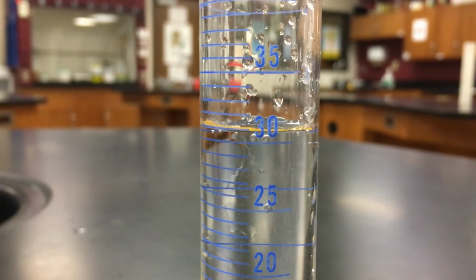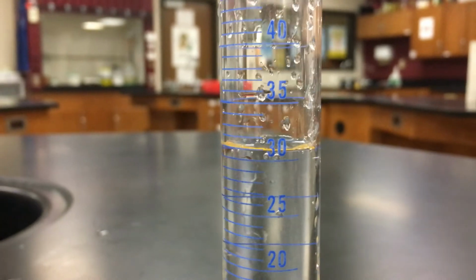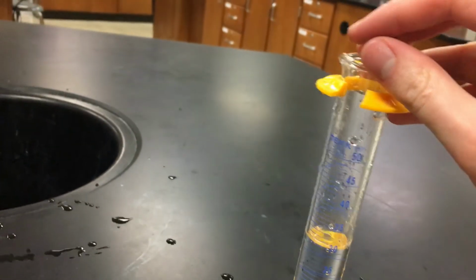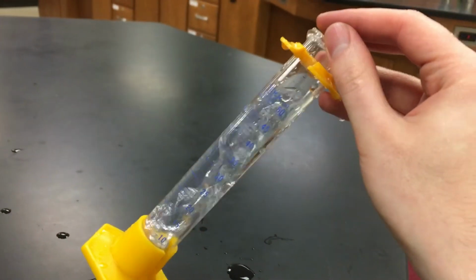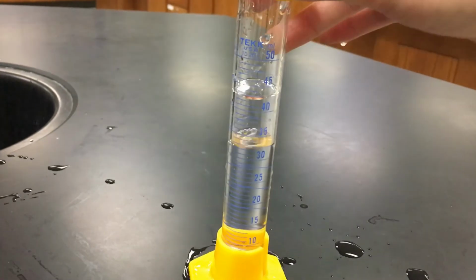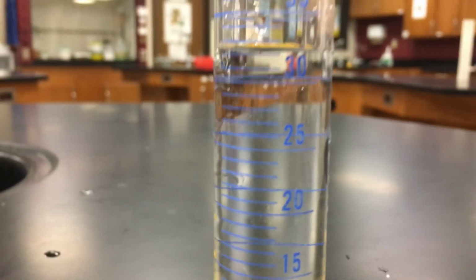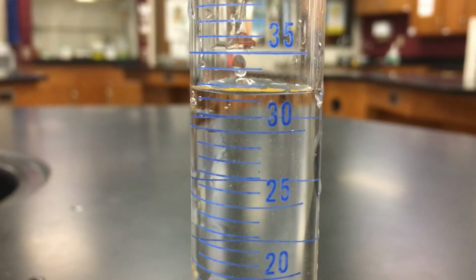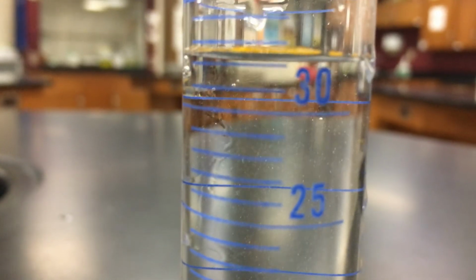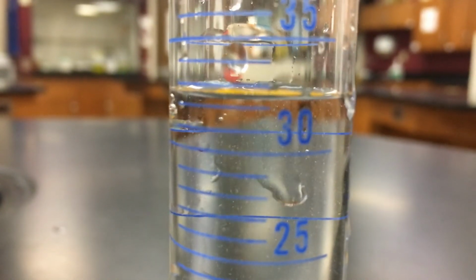So I am starting at about 31 milliliters. I'm going to drop in my marble very carefully and see how that water level rises. So I'm going to tip my graduated cylinder a little bit, drop it in there. Oh, I got a little bubble there. Okay. And my water level is now at, let's see, 30, 31, 32. Not quite. Looks like about 32.5.